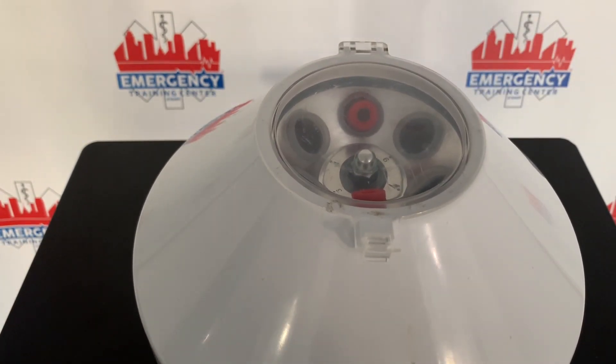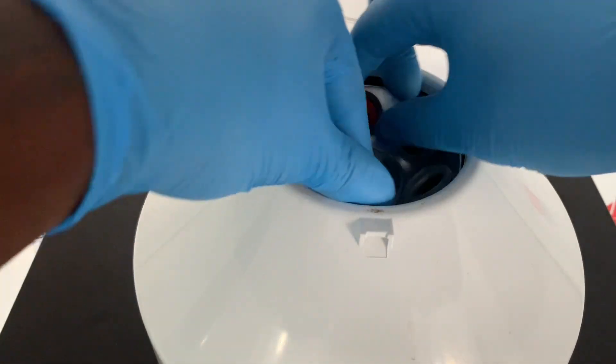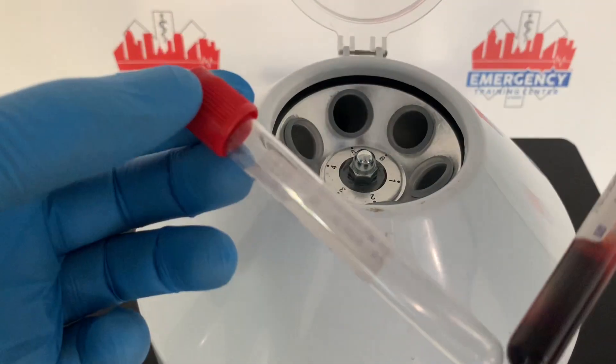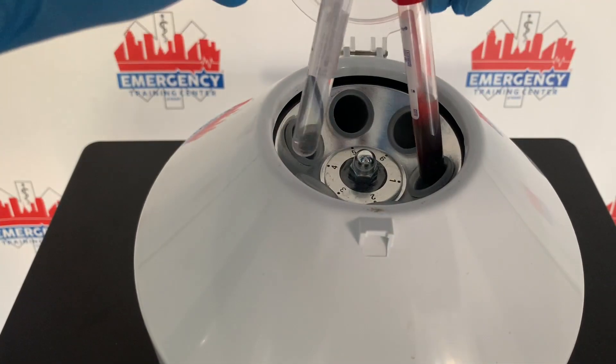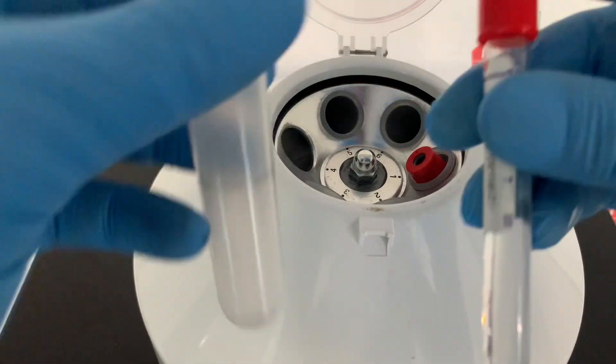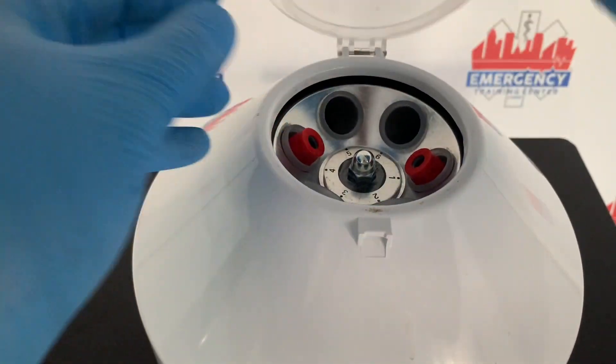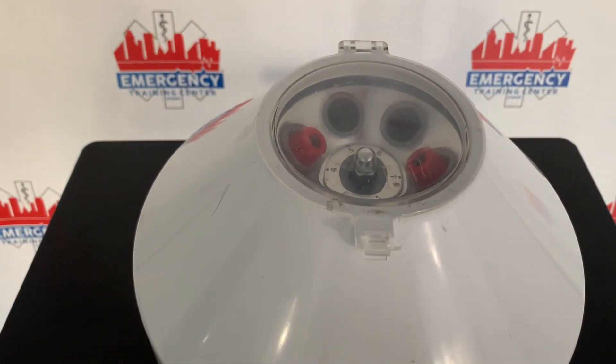You have two specimens in there, right across from each other, as you can see. Specimens going in the centrifuge should always be placed across from each other. There are also special containers which you're supposed to put the specimens into.